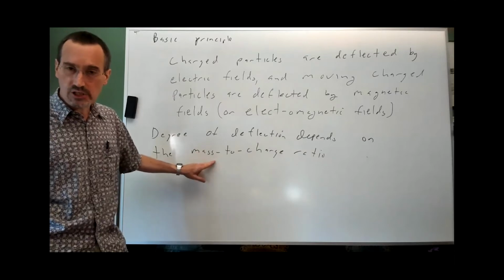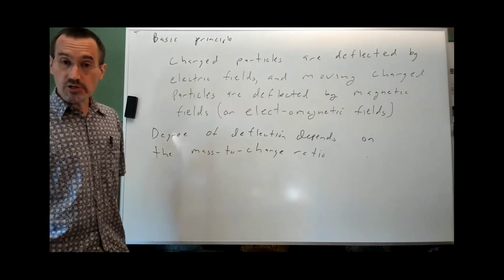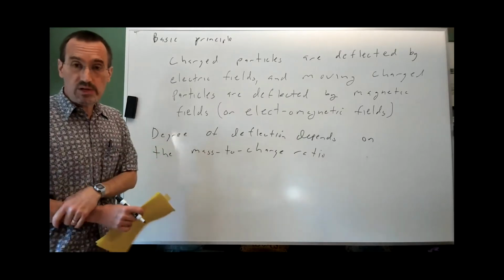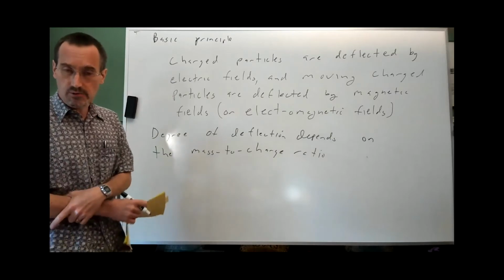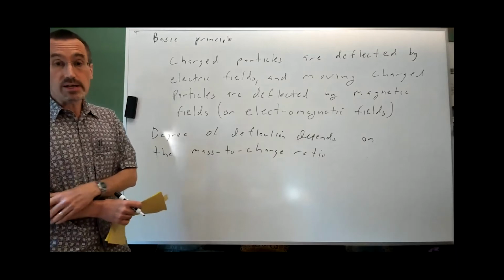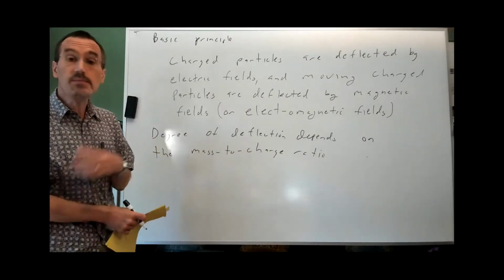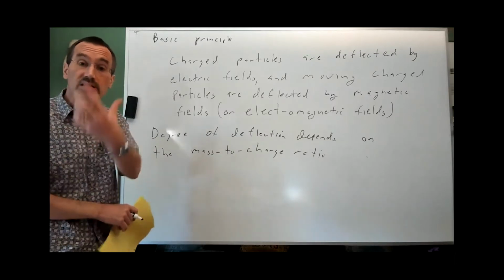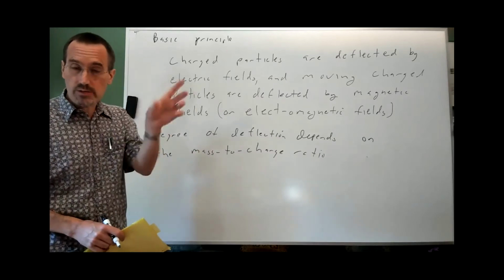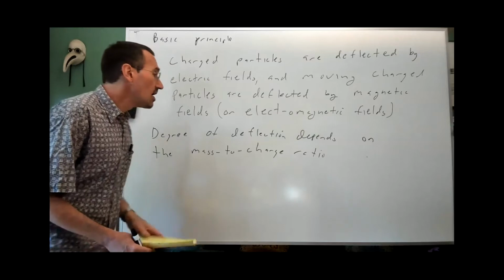It is the ratio of mass to charge. And with larger molecules, where you may sometimes have more than one charge on the molecule, the peak that you're seeing is not the molecular weight of the monoprotonated species. It may be the molecular weight of a diprotonated species, or the species with a proton and a sodium on it, or two sodium ions.